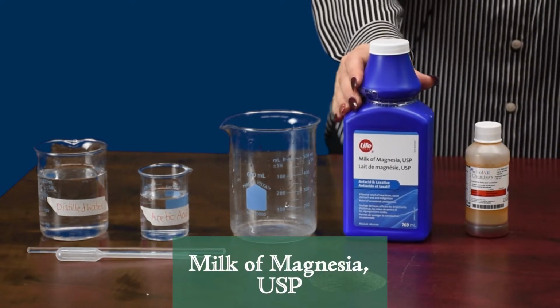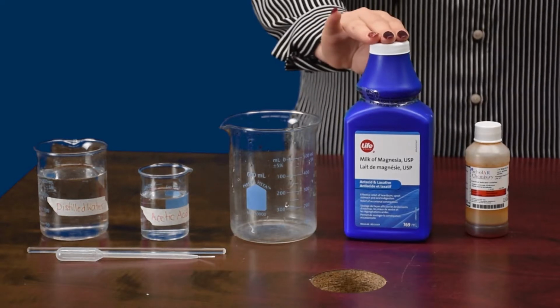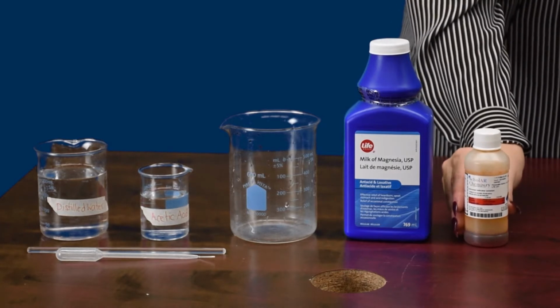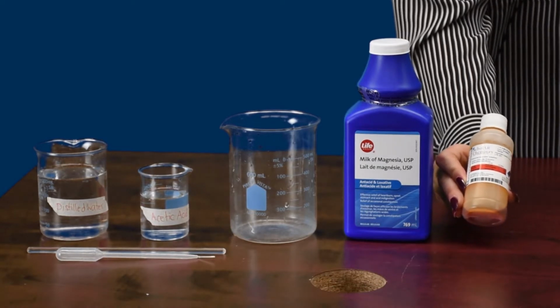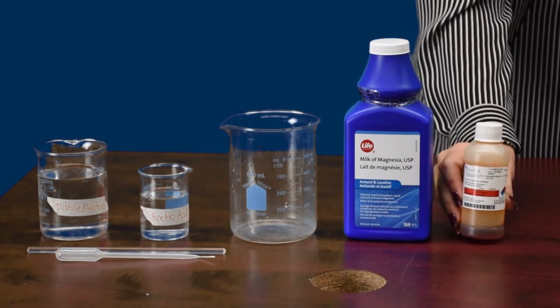For your chemical, you will need milk of magnesia. You can find this at any drugstore that you can purchase. Typically it's used for digestion issues. The last thing you need is a universal indicator. This indicator you can purchase from any chemical supply store. It's important that you use universal indicator and not a different kind of indicator.